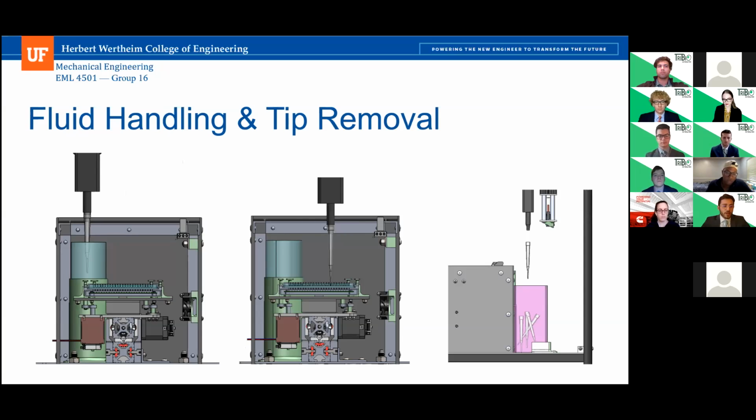As can be seen in the left image, there's a turquoise colored cup, which is an off-the-shelf 235 milliliter fluid container. Since our maximum case needs 150 milliliters for 3 sets of 50 milliliter conical tubes, this is more than enough fluid to ensure the user won't have to manually add a new cup of new fluid. Assuming it's the same fluid being added to each well plate or conical tube, only one nozzle will be needed to go back and forth between the well plate and the cup.